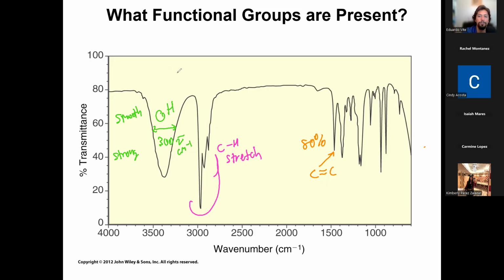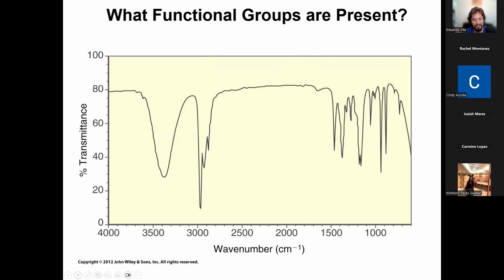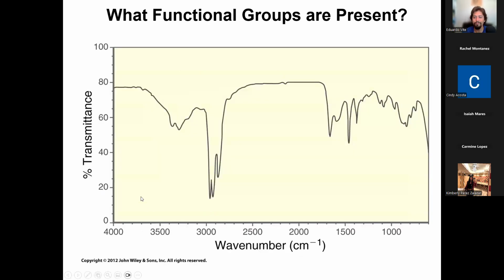So in this case, we kind of stick to what we can claim. We definitely know there is an OH. There might be a carbon-carbon double bond, but we don't know, right? So we will discuss it, but we wouldn't really report it. I wouldn't really make the claim. And that's all we can know about this. We need a formula, we need to take NMR, we need to take melting point, something else to determine what else the molecule could be. But this is all we can learn from the spectra. All right. So next example. How about this one?